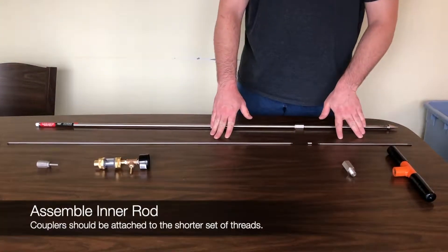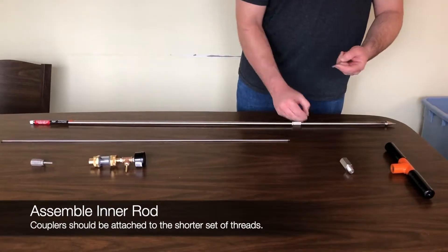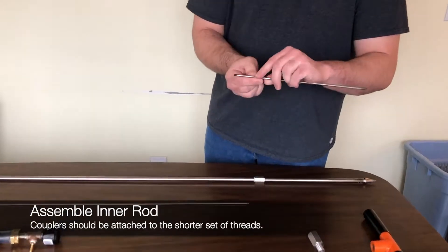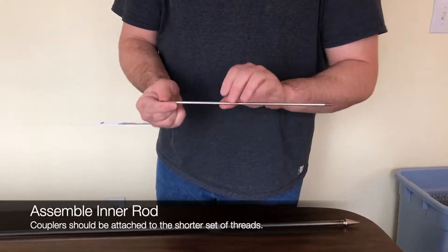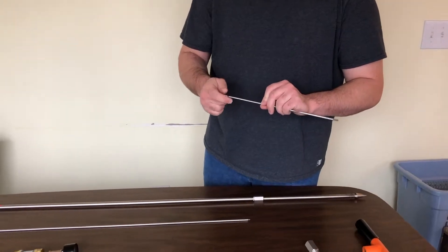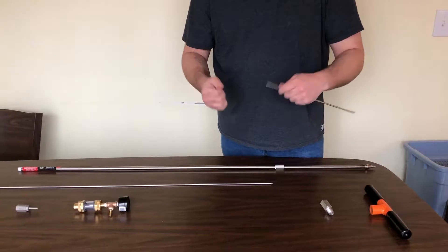After that, we can assemble the inner rod. When assembling this, you want to make sure that the couplers are attached to the shorter set of threads so that the inner rod will fit into the probe itself and you can ventilate or remove it. Otherwise, it will be too short.